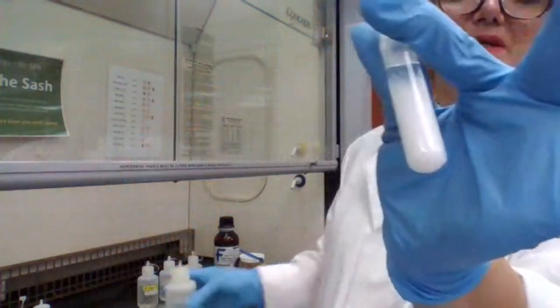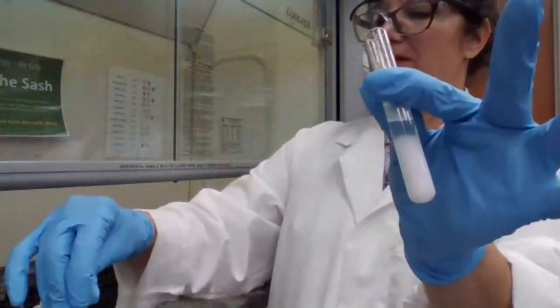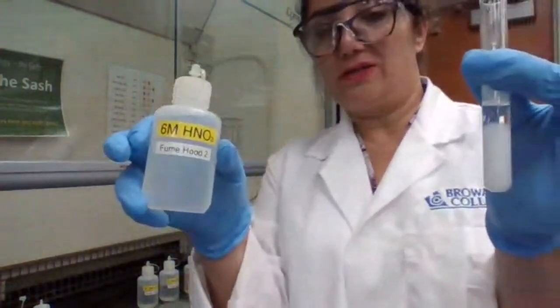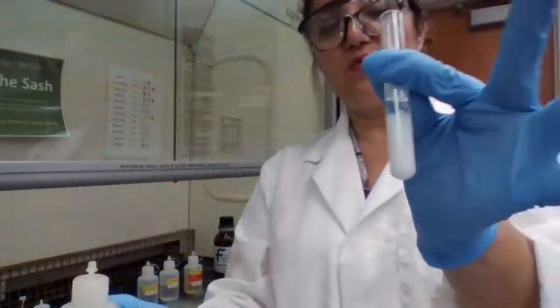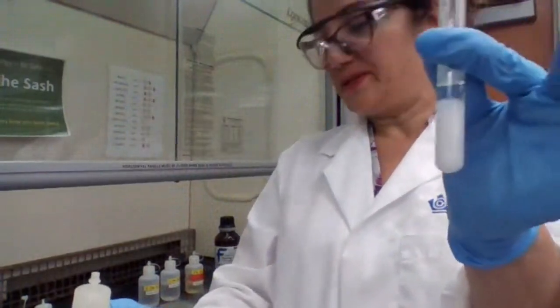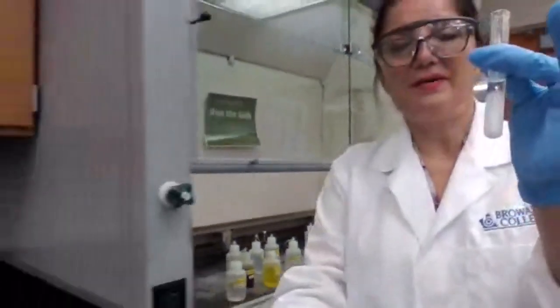A white precipitate formed when I added the nitric acid. When I added ammonia, the AgCl dissolved and I had a clear solution. When I added the nitric acid, a white precipitate formed. This is part 1E, and the white precipitate is the confirmation that we do have silver ion.